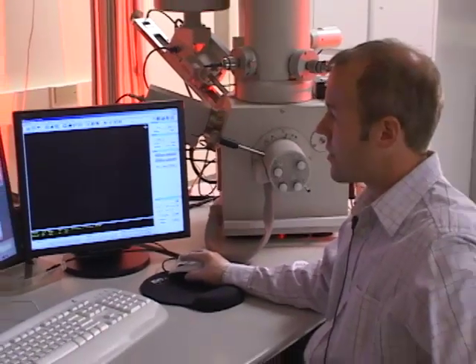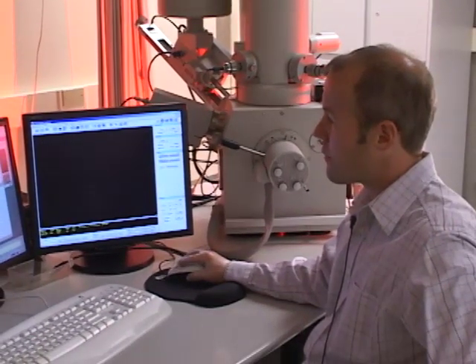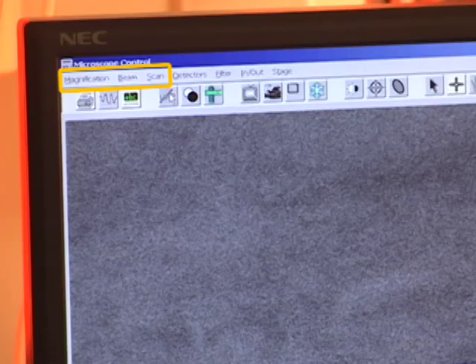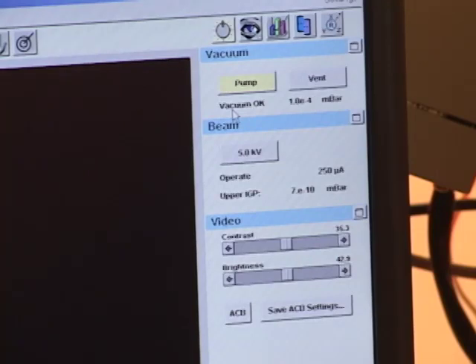Most of the software that we're going to use today is located in the first three tabs: magnification, beam, and scan. And also the four sub-menus on the right are the blue bars: vacuum, beam, video, and stage.